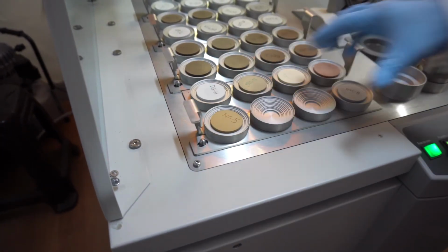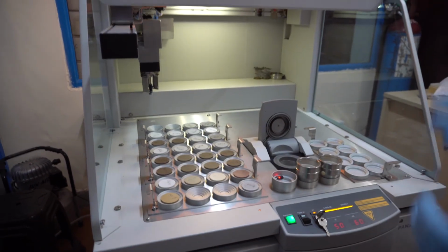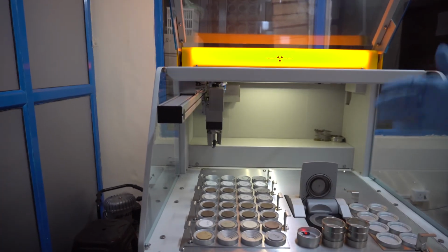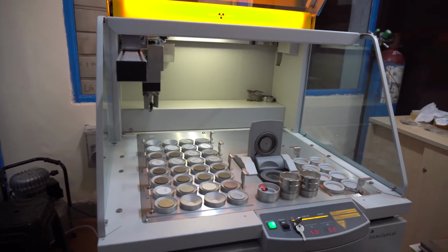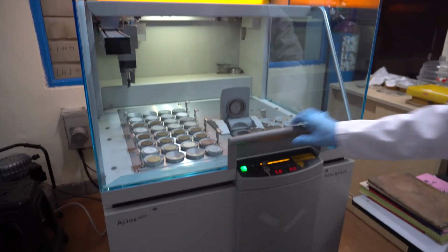These are the sample holders. There are 64 sample holders, so we can analyze 64 samples at a time. This is the automatic sample changer, which changes the samples automatically, and one by one they go inside. So now I will show you how it works.